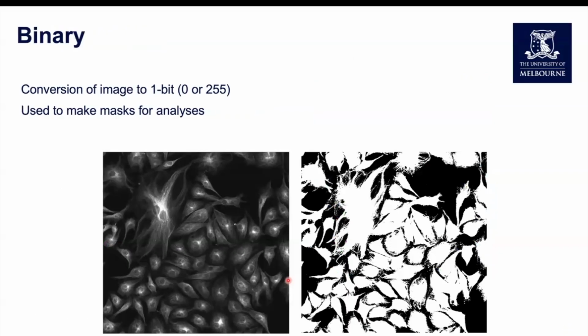Okay, all of those, what we're aiming to do is convert this fluorescence image into this binary mask. And I've mentioned this already. Essentially, a binary mask is an image with two different grayscale values. So it's got zero intensities or a maximum intensity. And again, all we're doing is telling the software we only want to quantify within the white regions within the image.